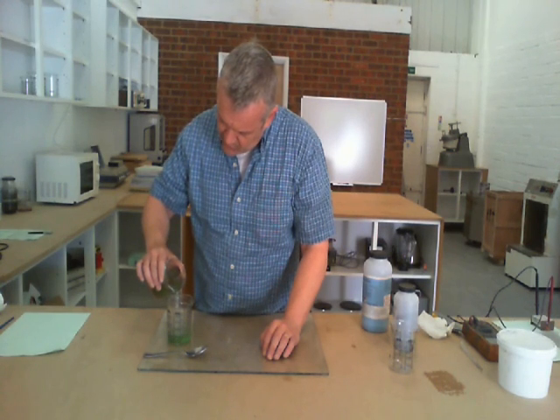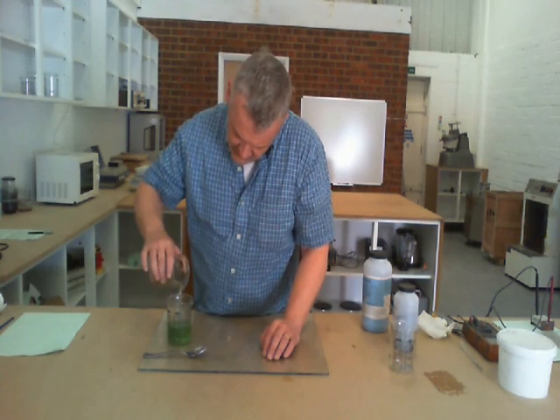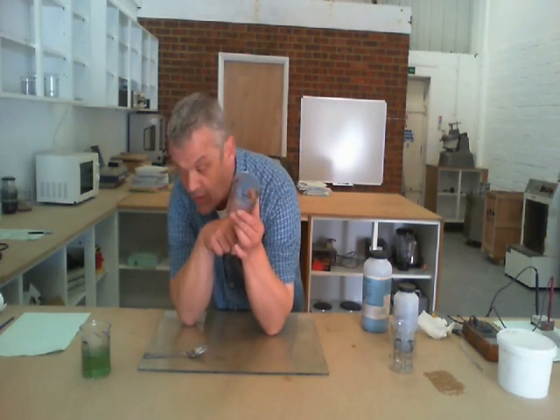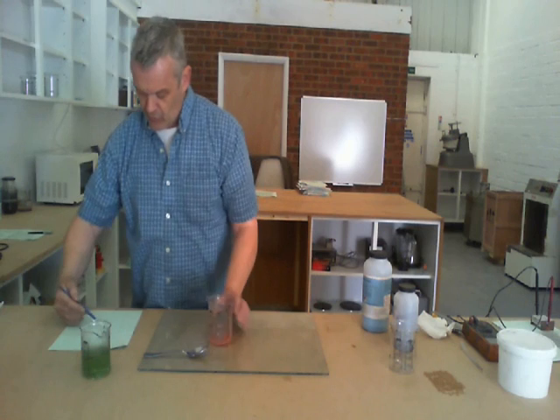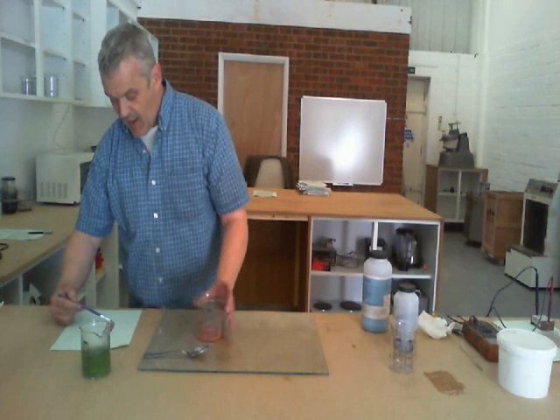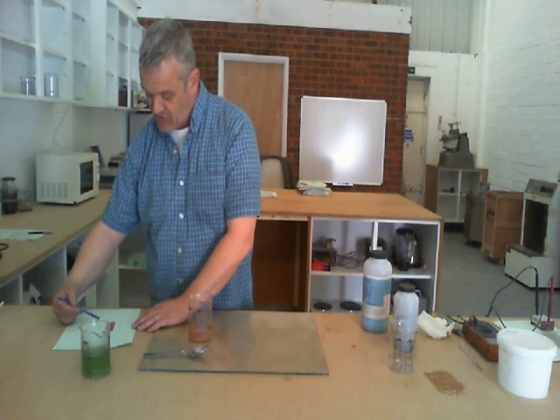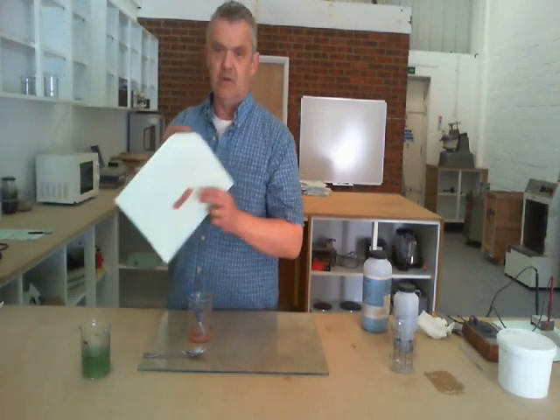Now we pour that top solution off and put it to one side for a moment. You can see the copper in the bottom of the beaker there and we can turn that copper into an ink in the same way that you turn any of these materials into an ink or paint. I'm not too worried about it at the moment so just paint a little bit of it on there. Now because I'm doing this in air, it will oxidise and it begins to oxidise almost immediately. The only thing that was stopping it oxidising was the ascorbic acid which is now actually in that beaker there. So paint my copper on there and just leave it to dry.